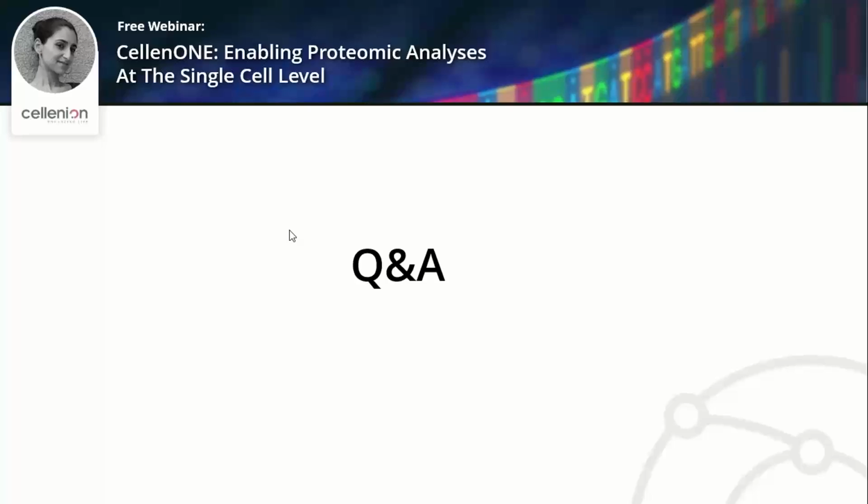Can I have one more question? Does this involve any fractionation, and what kind of MS and MSMS techniques were used? We use the Orbitrap, so the regular tandem mass spectrometry workflow. It's exactly the same instrument and all that we used from the paper that was published on SCoPE2. So we don't do anything more than they do, except changing the instrument that we use to prepare the workflow so far. Okay, brilliant.